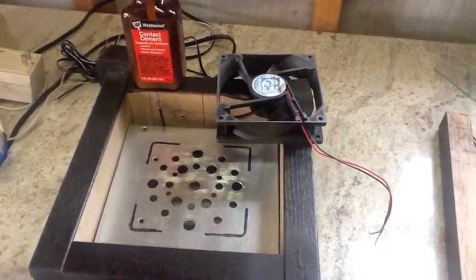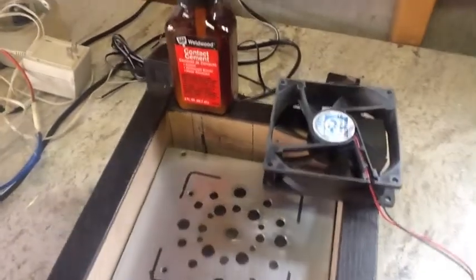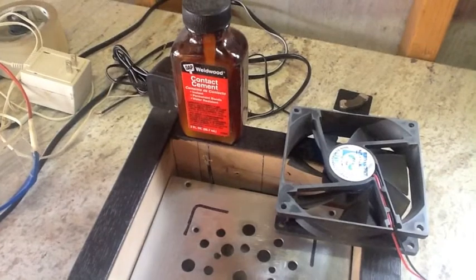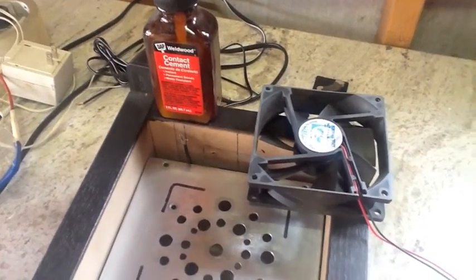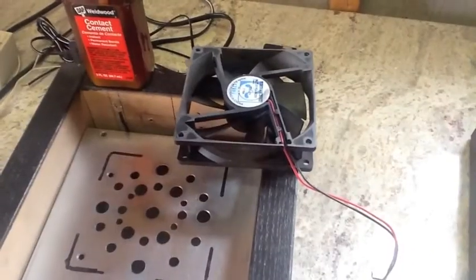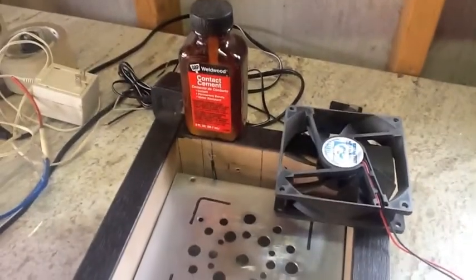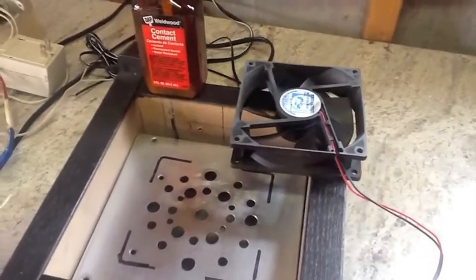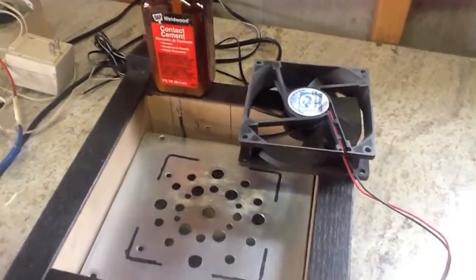I've marked out where the fan's going to be positioned, and what I'm going to use to hold this fan down is just contact cement, just to get it secured. Later on I might run a couple of screws through these holes, but I don't feel like messing with that now. In my experience, contact cement — once you get it on one piece and then the other piece and you put that stuff together — boy, it's hard to pull that stuff apart. So I think it's going to work just fine.